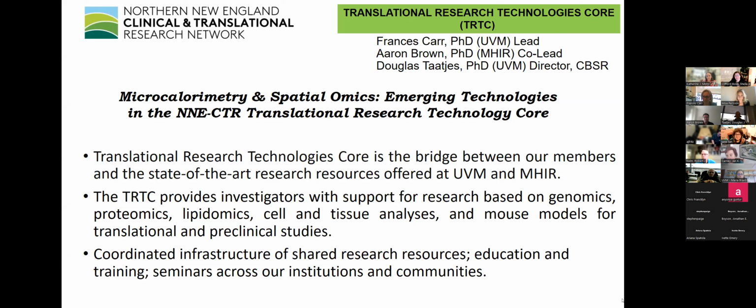I appreciate the introduction. I'm just going to take a couple minutes of your time to give a little bit of an overview of the TRTC, the Translational Research Technologies core, in case people aren't familiar with the breadth of what's actually offered here. The TRTC we think of is actually the bridge between our research resources, the state-of-the-art programs and methods and technologies offered here both at UVM and at MaineHealth. The TRTC provides investigators with support for research based on genomics, proteomics, lipidomics, cell and tissue analyses, as well as mouse models for translational and preclinical studies. The coordinated infrastructure of the shared research resources, education and training, seminars, across our institutions and communities. So we offer a breadth of programs throughout.